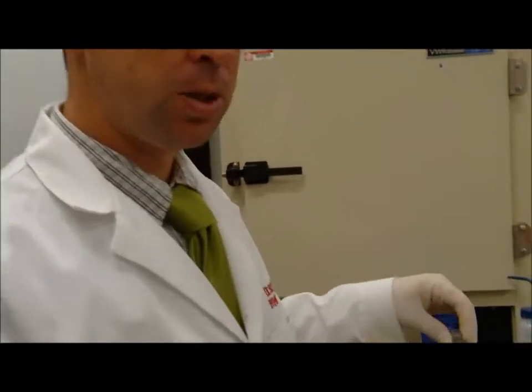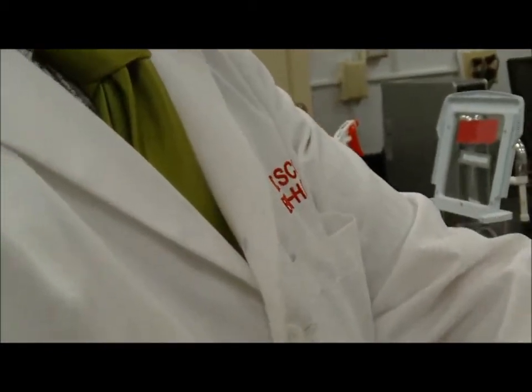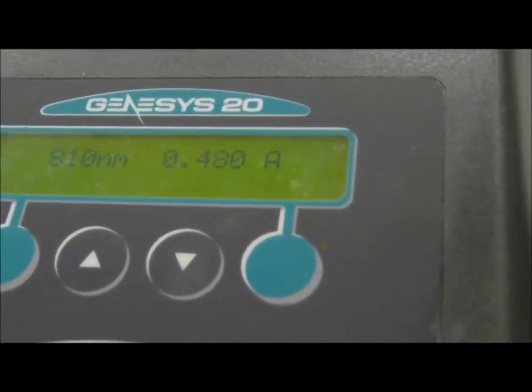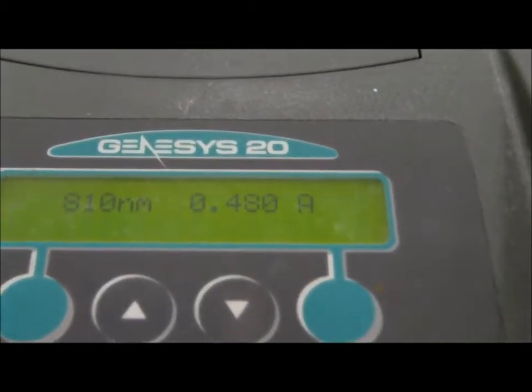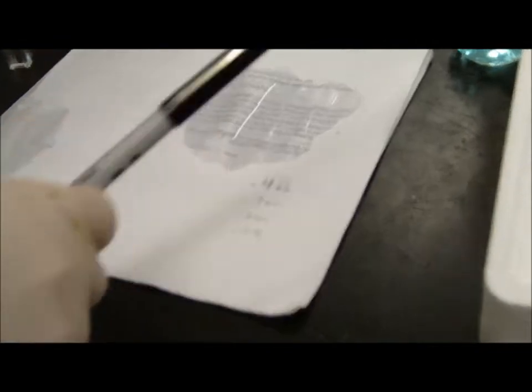All right, I have my unknown sample here. Check the absorbance of my unknown sample. And it says 0.480. So I'll write down my unknown value as well. Okay. So we go over to the board.